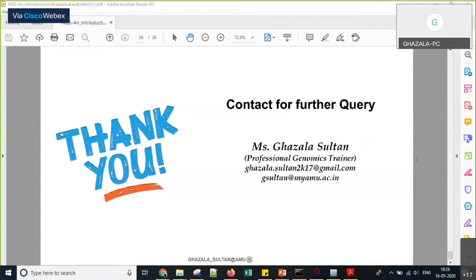All these things matter when we do the analysis, because if one tool is taking 10 minutes for the answer and another tool is taking 1 hour, we will prefer the tool which gives the result in 1 minute. And the result should be sufficient also, not missing results. So first we need to do some research on the tool itself before using it. Then we decide which tool we need to go further with for the analysis.